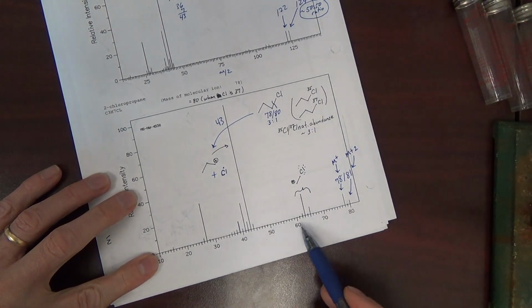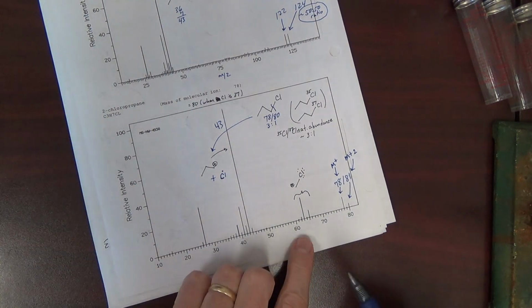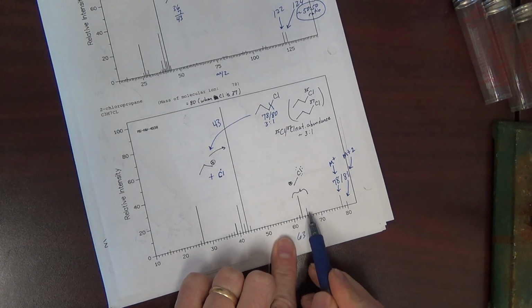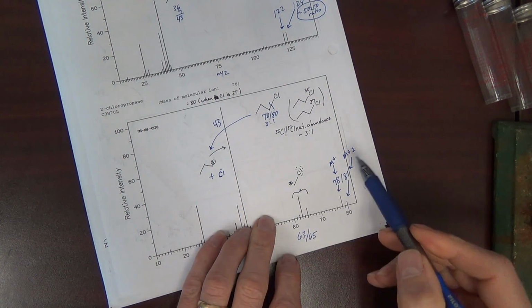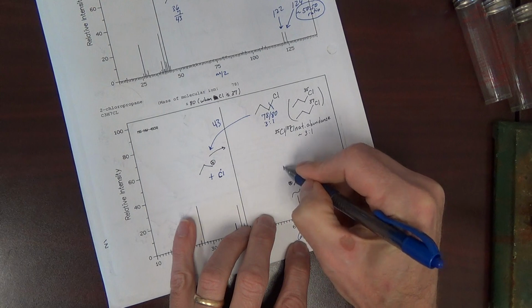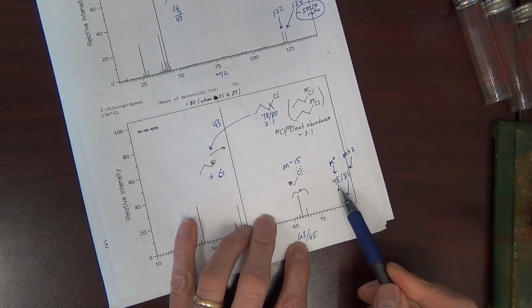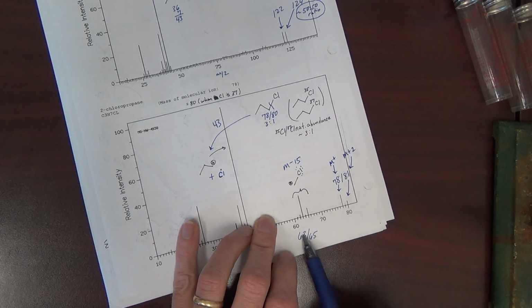But down here we also seem to have, again, same molecule, we're just changing the halogen. We seem to have these peaks at 63. But look at this, it looks like a 3-to-1 ratio. This looks like a chlorine isotope pattern, 63-65. That is 78 maybe going to 63, and that's going to 65. 78 to 63, this would be M minus 15. In both cases, these two lost 15 to form these two.